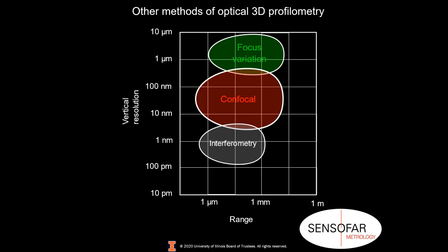Ellipsometry is not the best method to determine roughness of your sample. It can be used as one of the parameters in the fit when you're feeding the data, but I wouldn't consider it a very accurate measurement of your roughness. I would always refer to a stylus profilometer or AFM if it is the top surface. If it is the interface, then I think you should do all of them, XRR and ellipsometry and this one, and compare the results that you get for each one of them. Okay.